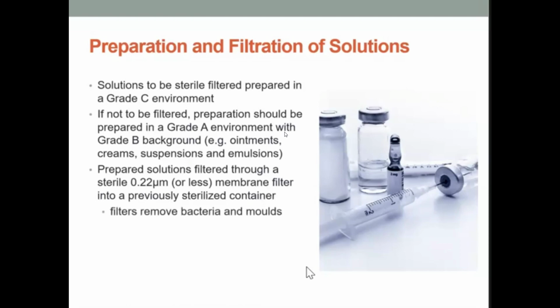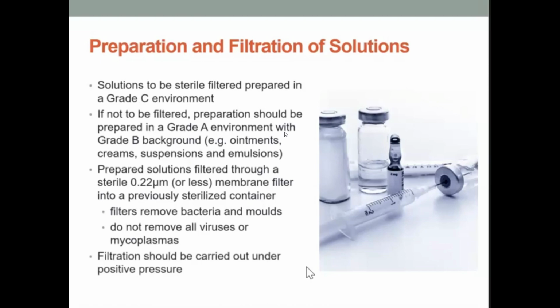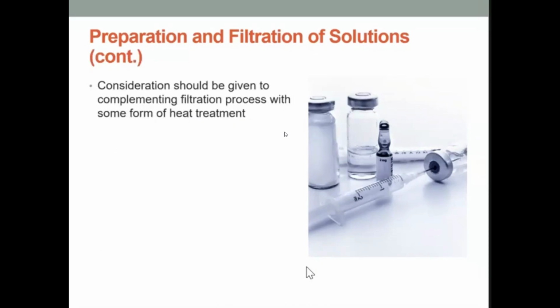The filters remove bacteria and molds. It doesn't remove all viruses or mycoplasmas. Filtration should be carried out under positive pressure to prevent any dust, dirt or contamination from entering the room. Consideration should be given to complementing filtration processes with some form of heat treatment if possible. And that might be for your filters, for your glass, for other aspects of the process if your product cannot be sterilized using heat treatment.